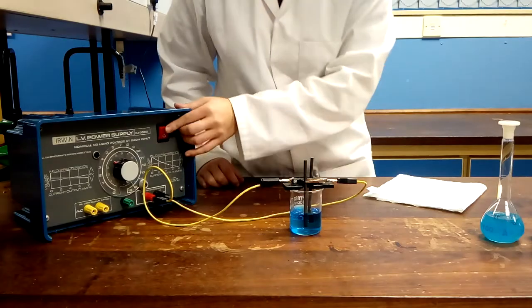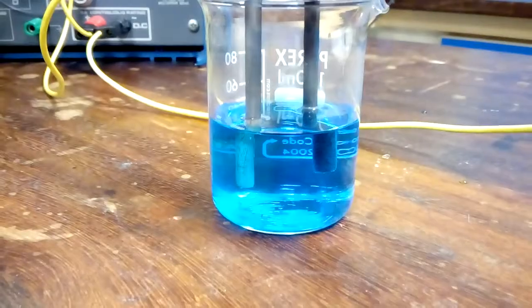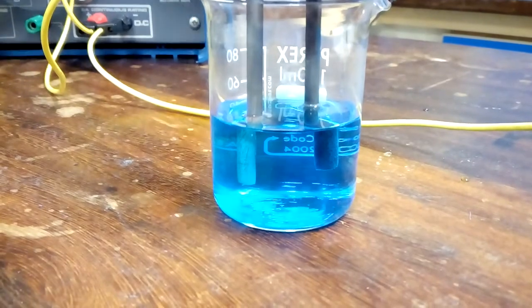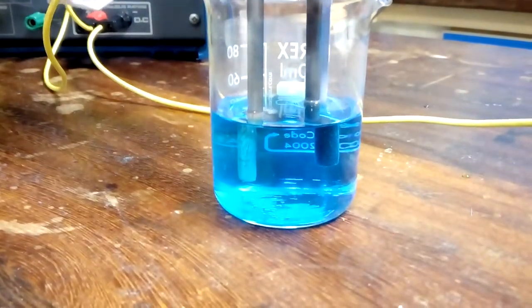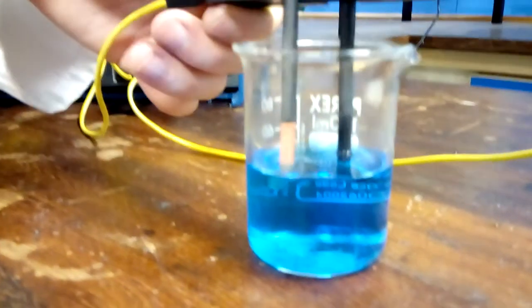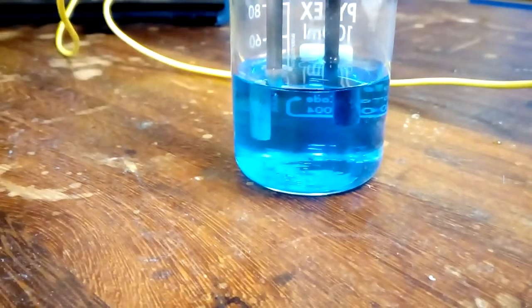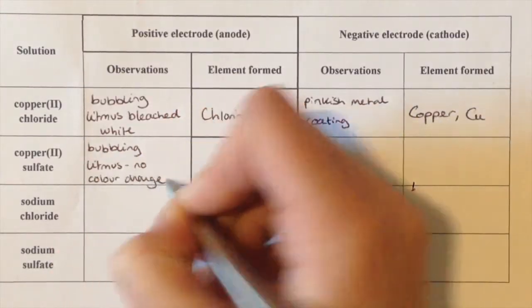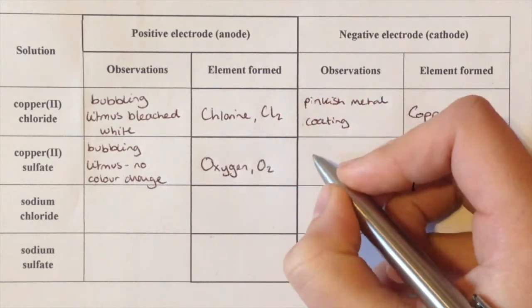Turn on the power supply and observe the electrodes. Here, you can see bubbles at the anode. When testing with litmus, it does not bleach white this time, but it remains blue. A pinkish metal deposit has also formed on the cathode. Fill in the table with your observations.